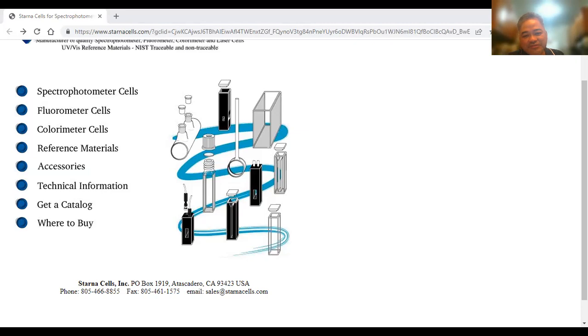So to make sure you have them matched, you usually use, at least in our country, di ba? Isang cuvette lang. So doon mo na lahat i-measure, right? Now, there are many automated instruments that have flow-through cells with temperature control. You seldom have this thing. But that's all what we could say. Yung flow cell na meron dyan. So, papasok dito and then lalabas dito. They can do that. Okay, but I never have experience using that system.